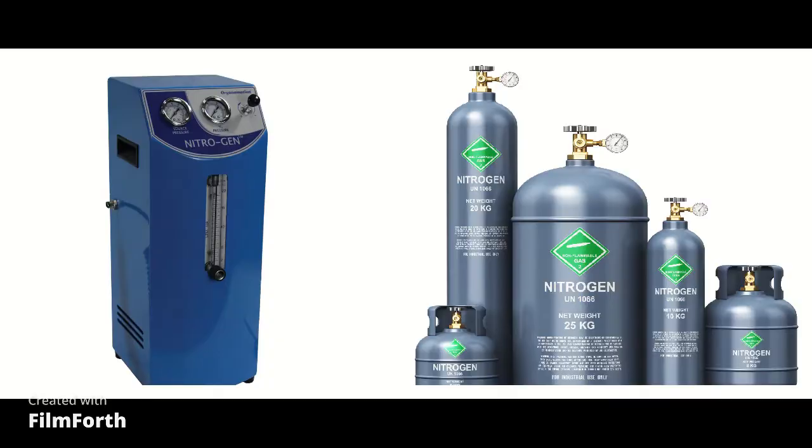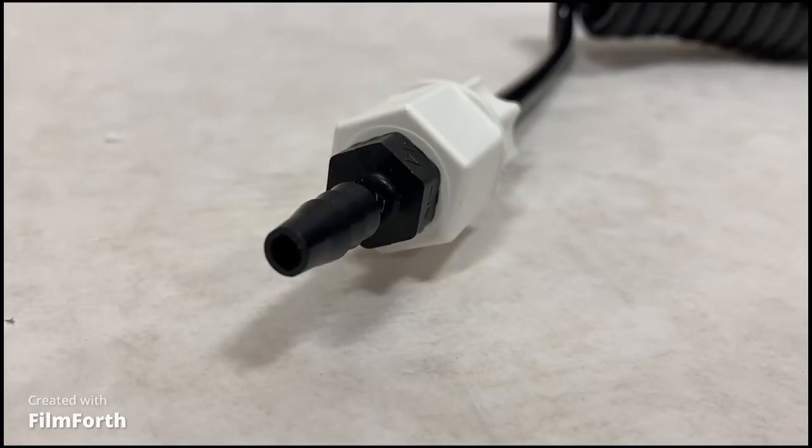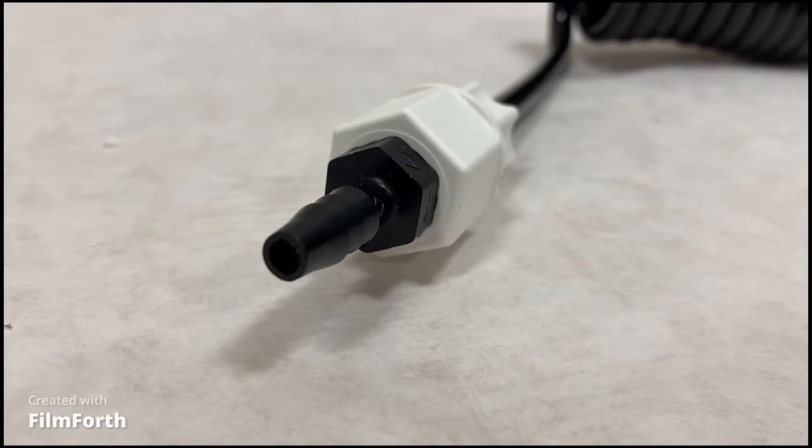Most commonly, Organimation evaporators are used in conjunction with a nitrogen generator, nitrogen cylinder, air compressor, or a lab's built-in gas source. Each unit will come with a coiled gas supply tube and a multi-part fitting to connect to a gas source.